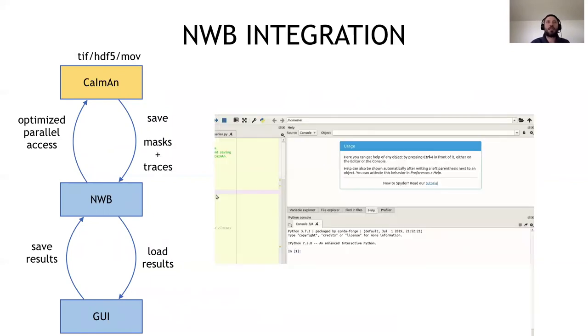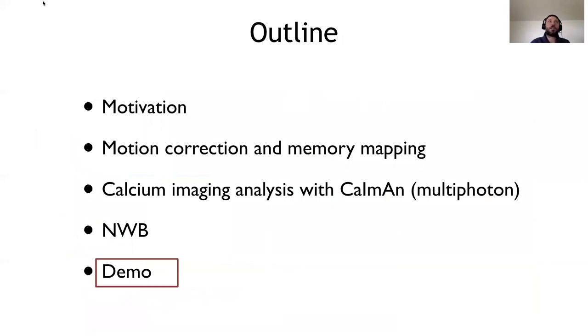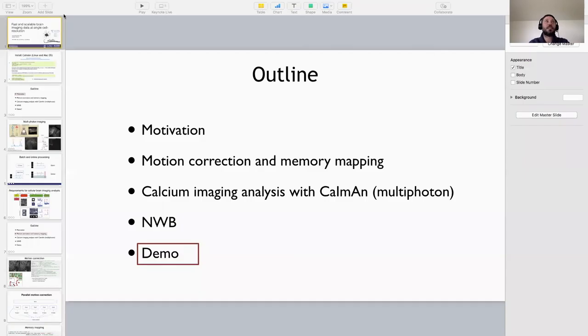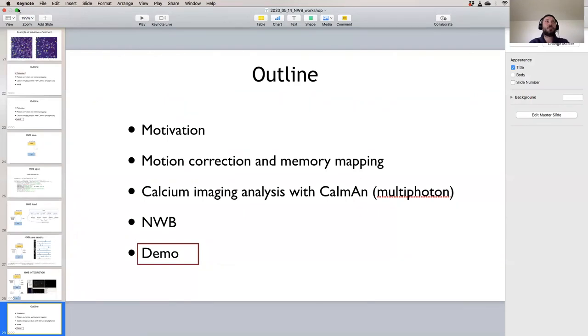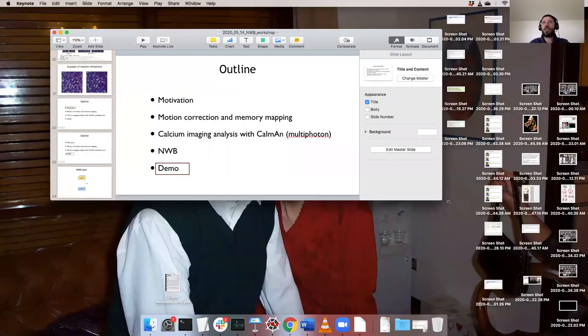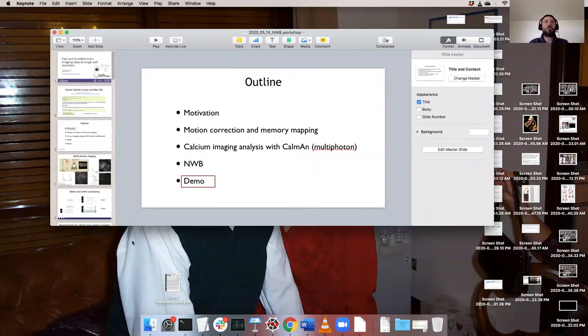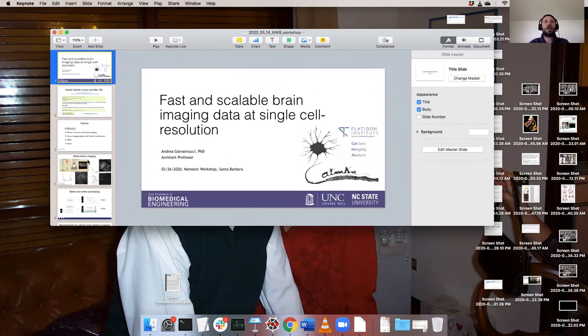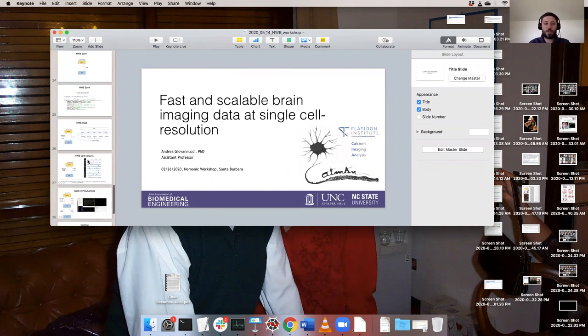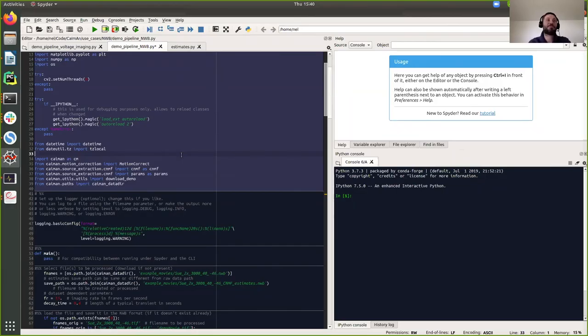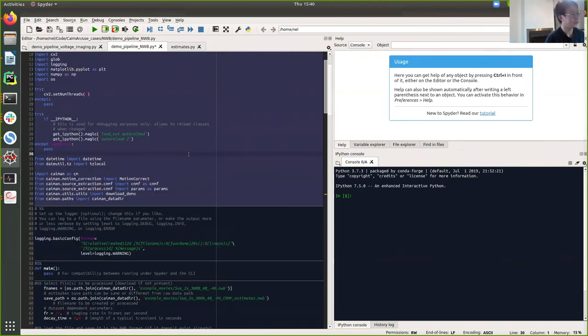Now I am going to pass the screen to Changjia. That is a graduate student that is going to show you how to run a demo. Changjia, I'm not sure, maybe I will pass the link to the demo on GitHub if they want to follow along. But I'm available to answer questions that you have in the group chat while Changjia is running the demo. Next I will lead you guys through this demo. I will focus on how to load NWB file and save into NWB format and also show you guys the GUI.